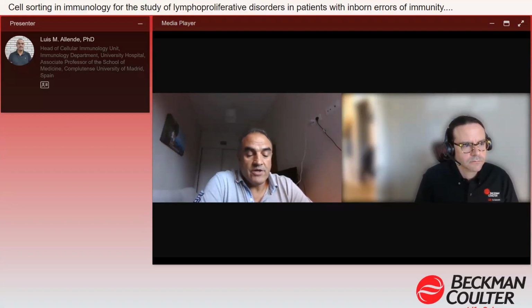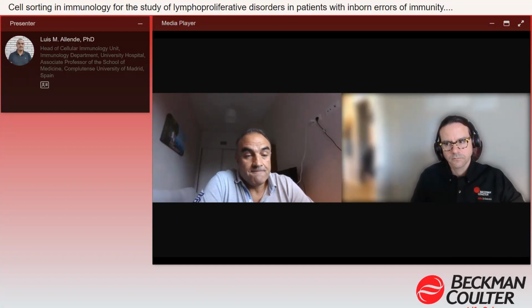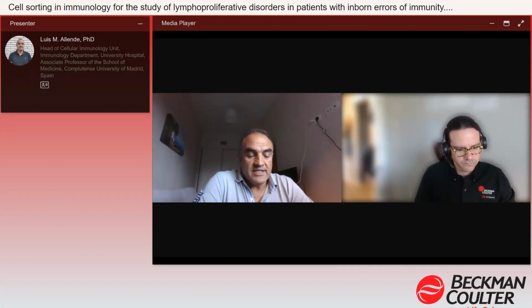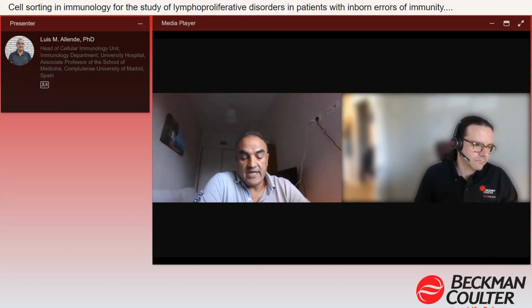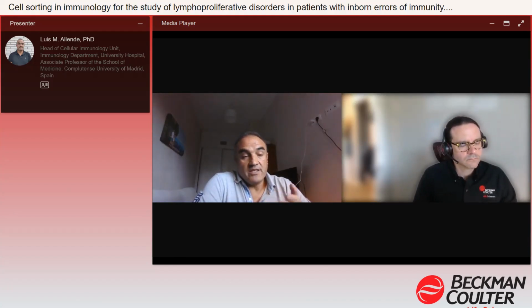All samples were from human whole blood. The first step was the peripheral blood mononuclear cells isolation by Ficoll. We usually begin the cell sorting with a minimum of 5 million PBMCs, where the main populations are CD4, CD8, CD19, and NK cells. We usually recover between 40 to 50% of cells. I think it's recommended to increase the number of initial cells when your population is less represented.